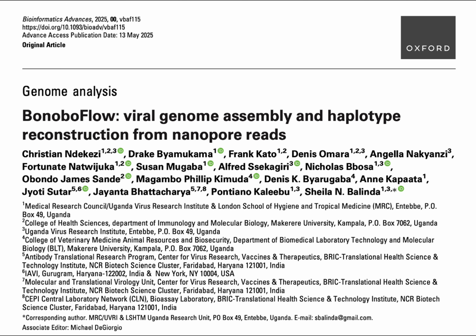Right, so if ONT is more accessible and it handles those complex regions better with long reads, what's the catch there then? Because there usually is one. A very good question. Historically, the main catch with ONT platforms was their inherently high error rate. Okay. The data wasn't as clean. Exactly. These errors could pop up as spurious substitutions, insertions, or deletions.